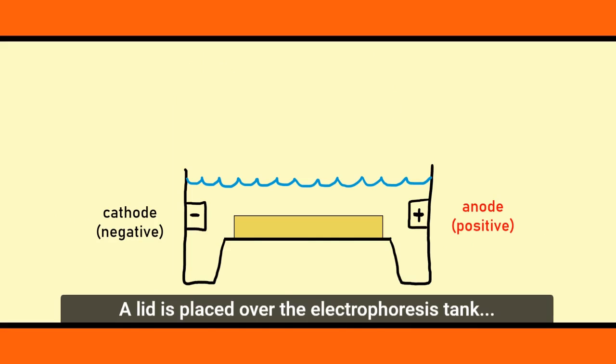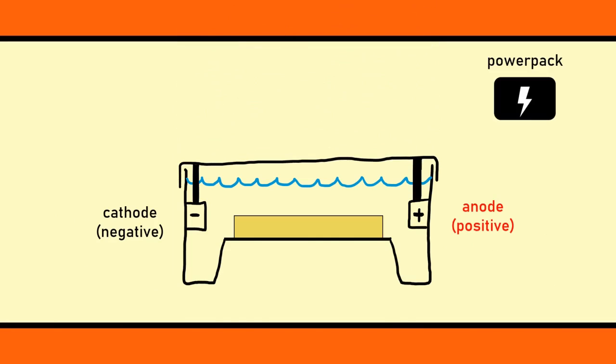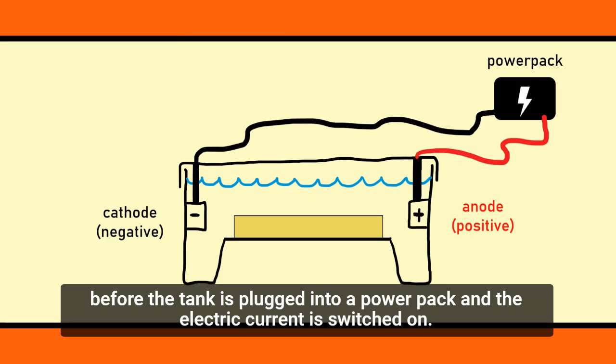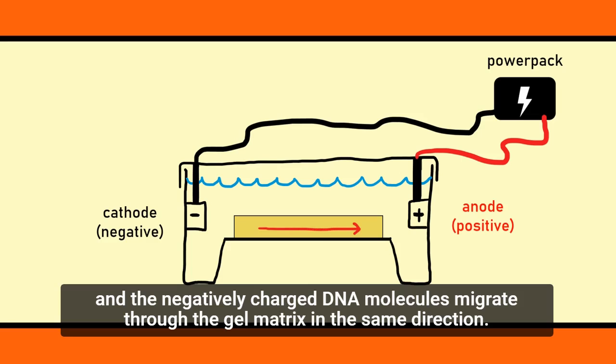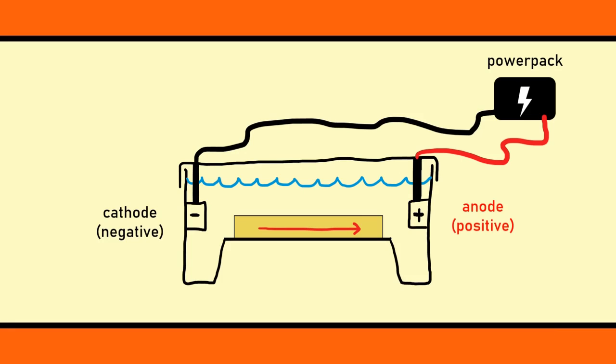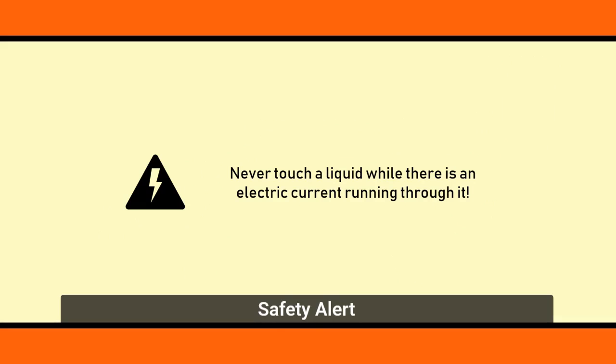A lid is placed over the electrophoresis tank before the tank is plugged into a power pack and the electric current is switched on. Negatively charged ions travel from the cathode to the anode through the buffer and the gel, and the negatively charged DNA molecules migrate through the gel matrix in the same direction. Safety alert: never touch a liquid while there is an electric current running through it.